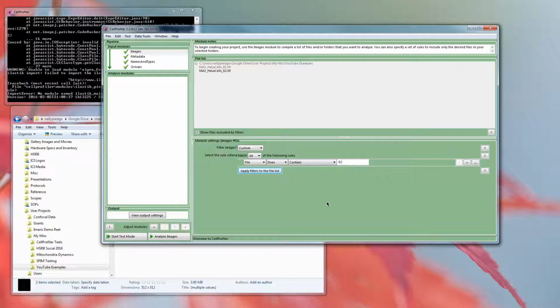So you don't have to go through the whole set when you're testing, you can jump between a few different ones. I often recommend people have 3 different files, a good one, a bad one, and a medium one from a particular set of images they've taken, and then play around and try and get the settings to work okay across the board, because you're never going to get it to work perfectly on the really dim ones and the really bright ones at the same time.